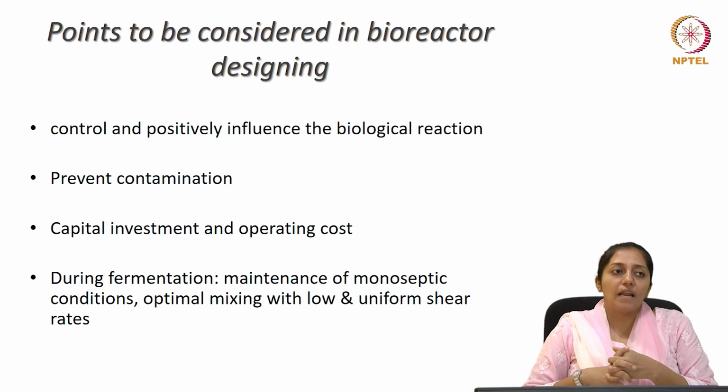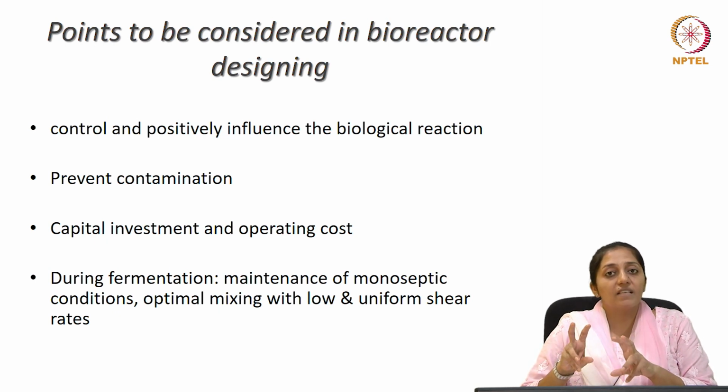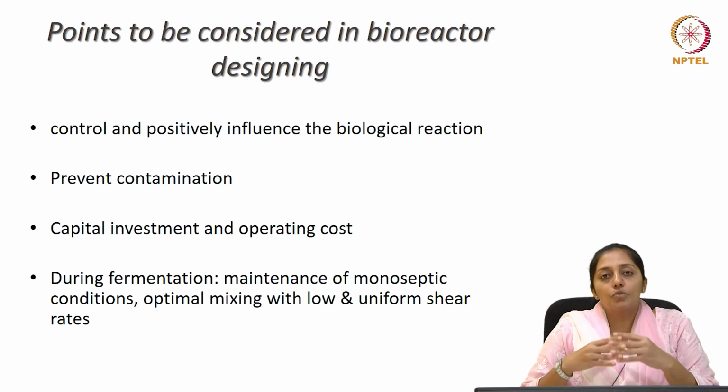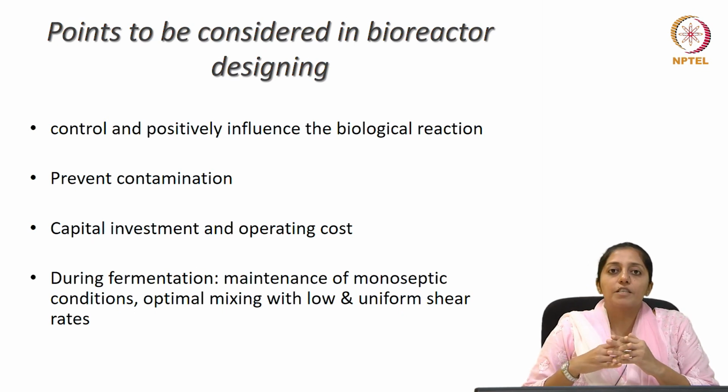Depending on the production platforms being used, the fermentation time can vary from hours to days and even sometimes to months. So the chosen reactor design should therefore also look into factors like optimal mixing, optimal heat transfer, and low and uniform shear requirements for maximum viability of the culture to achieve maximum productivity.